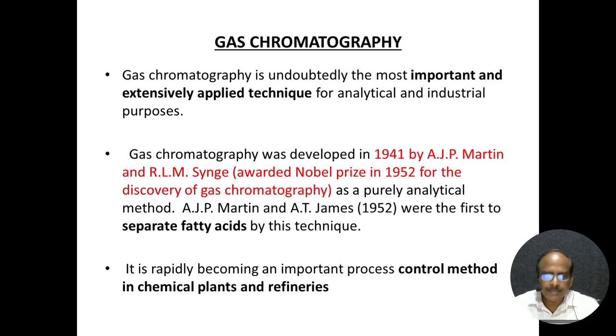Today we will discuss gas chromatography, the different types and the classification of chromatography. What is the versatile technique? Gas chromatography is the most useful chromatography technique.